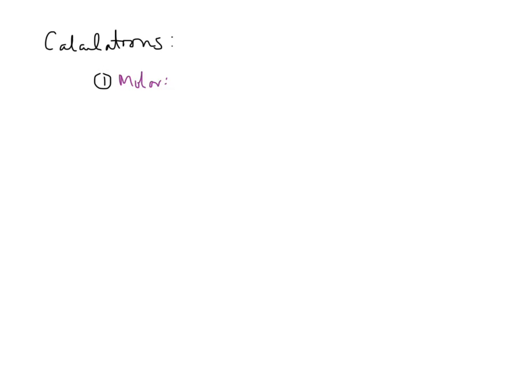There's no timing to this. You just mix it up, stir it up good, and then you're going to measure the absorbance, okay? So there's no time thing. And it really goes quick. So basically you're going to have 5 test tubes with liquids that you need to measure the absorbance of.